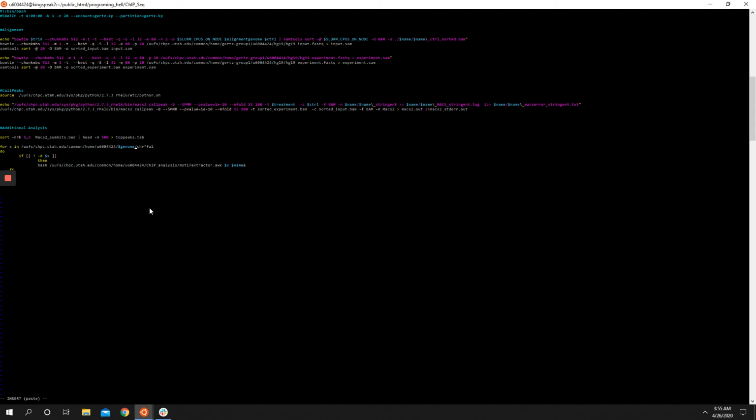So basically, I've got these FASTA2 files, which are essentially just the whole genome with all the new lines removed. So each chromosome is in one line.